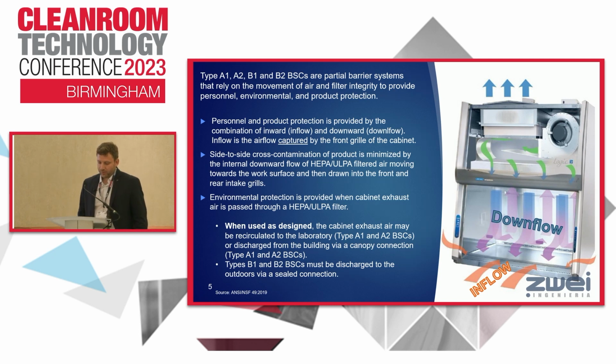All set points in the cabinet are defined by the manufacturer because they have done microbiological testing. The integrity of HEPA filters shall be tested using the aerosol photometer method to meet the current testing standards. The objective is to find leaks in the filters and the filter seals.